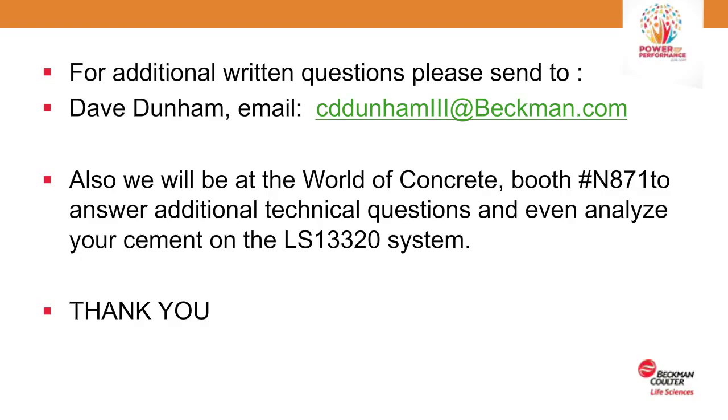As I mentioned during the lecture, the universal liquid module has a built-in pump, so it's drawing fluid from a source. This could be a 5-gallon container, or a gallon bottle sitting next to the instrument, or underneath the instrument if it's a 5-gallon container. It can draw it up from the floor. So it has a very good diaphragm type pump to pull clean fluid up for rinsing purposes.